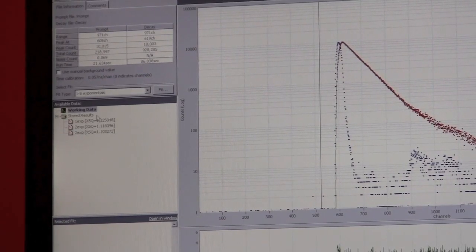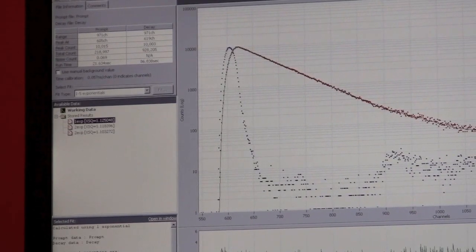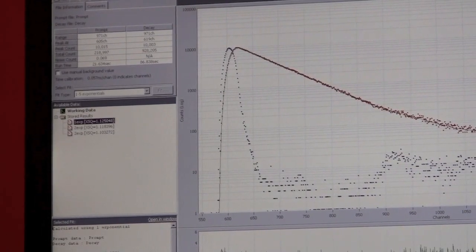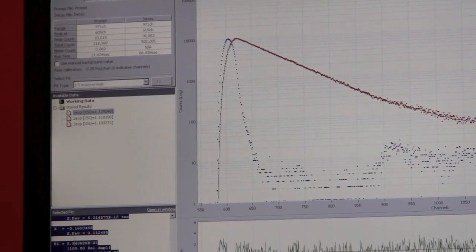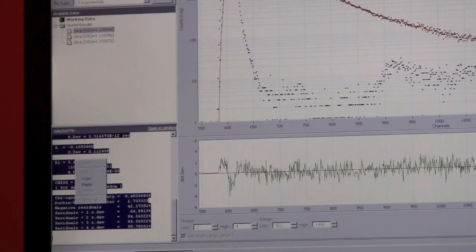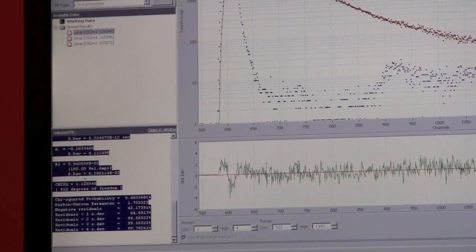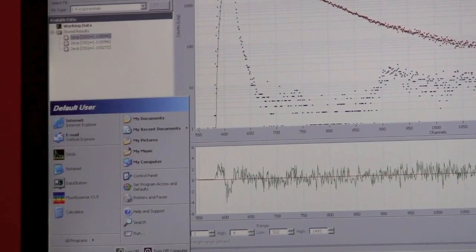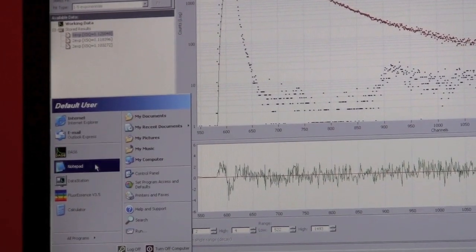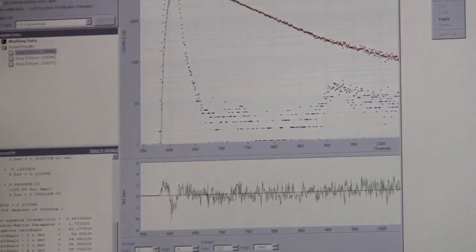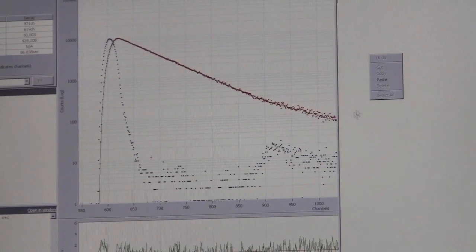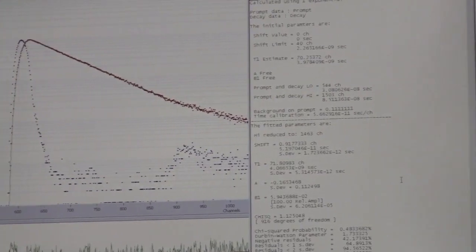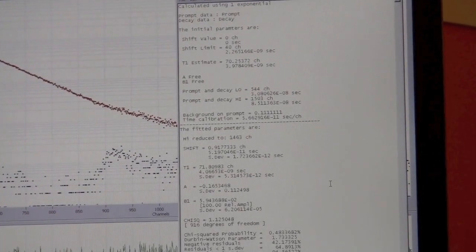To save your actual lifetimes, you would basically highlight this folder here, copy it, and paste it in a notepad. There you go. There's your lifetimes.